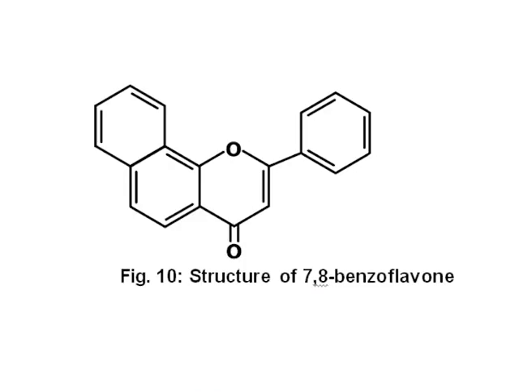The most common reagent for fixing iodine developed prints is 7,8-benzoflavone, the structure of which has been shown on your screen. A mixture of 2 ml of 10% 7,8-benzoflavone solution in dichloromethane and 100 ml of 0.1% iodine solution in cyclohexane is used for this purpose.